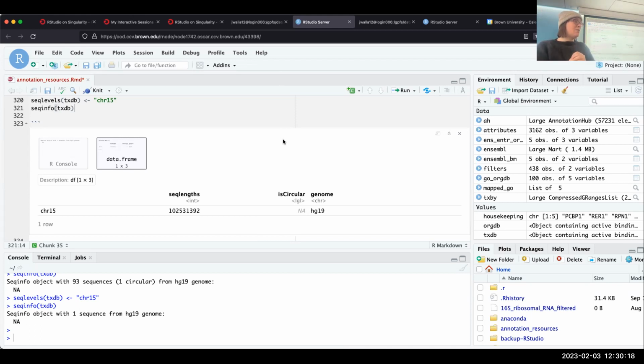I usually get around that by collapsing all the duplicates into comma separated values. It depends on your use case, but that's usually what I do, just because I'm apprehensive about picking one randomly. I don't know if I'm actually answering your question.